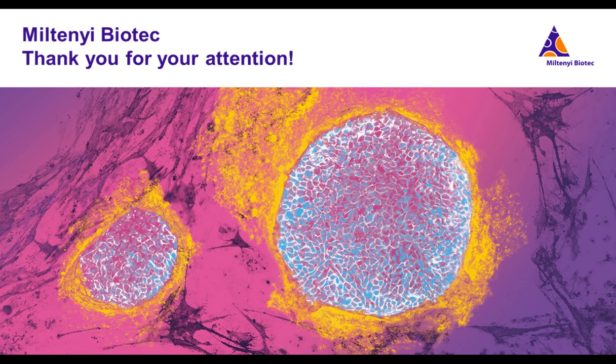So yes, you can extract data after segmentation of the sample, which is a prerequisite here, so that all cells are identified. Then all statistical options are open to you. So therefore, yes, you can do this and use every kind of statistical method you need to answer your question.